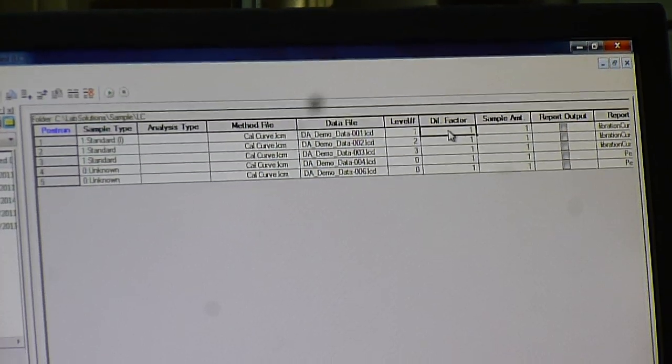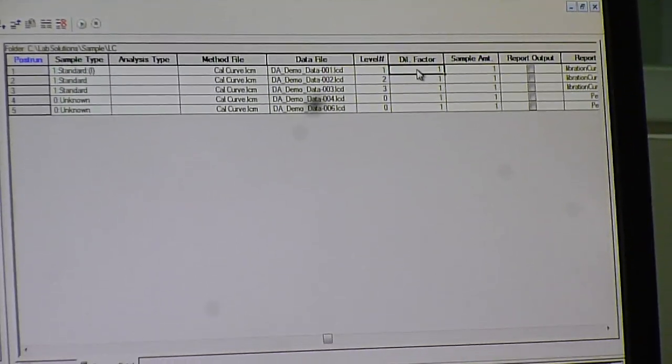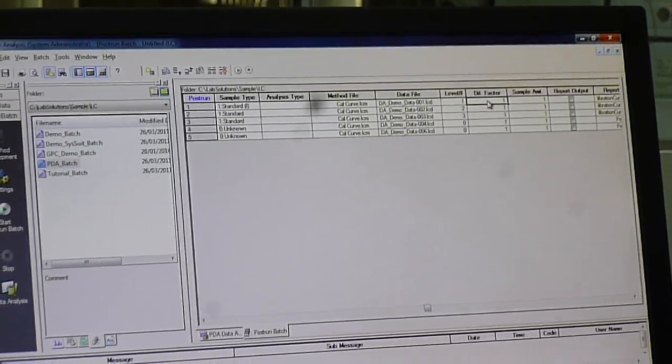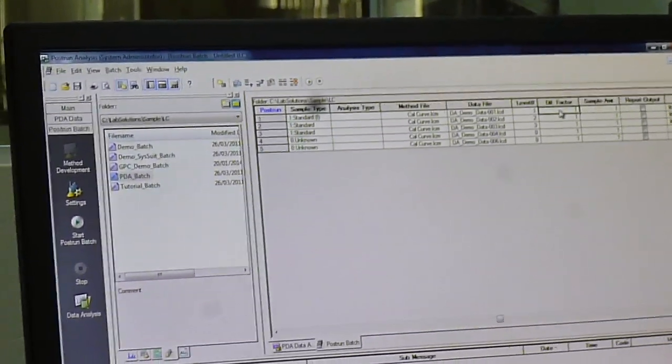Sample amount, what is it? It can be the purity of the standard, it can be a value that you multiply, I don't know. But if it's dilution, you don't have to multiply. No, if you have a concentration, you need to dilute to inject. I don't know, you dilute it 10 times. The concentration will be 10 times lower. So it will multiply. It will multiply for, sorry, it will multiply for this one. Sorry, you're right.